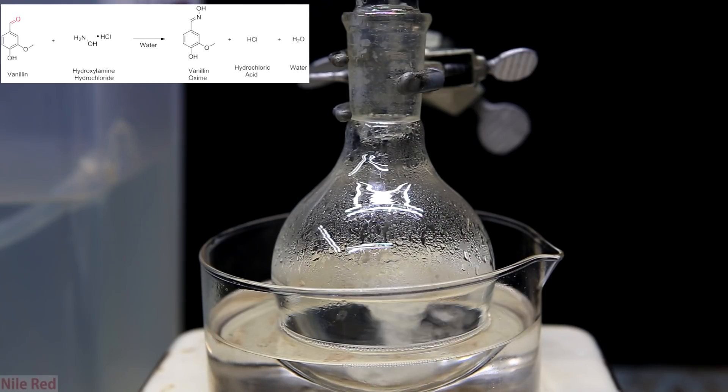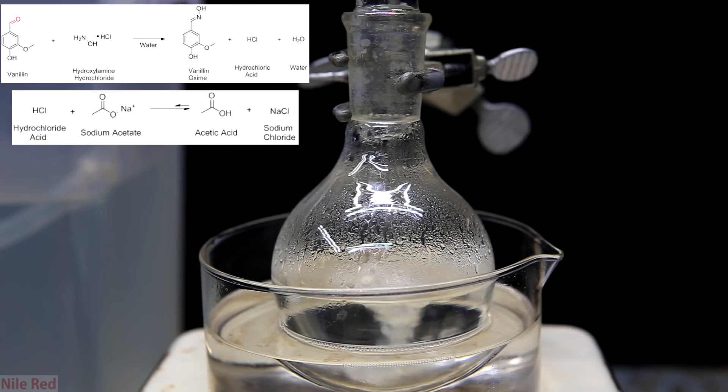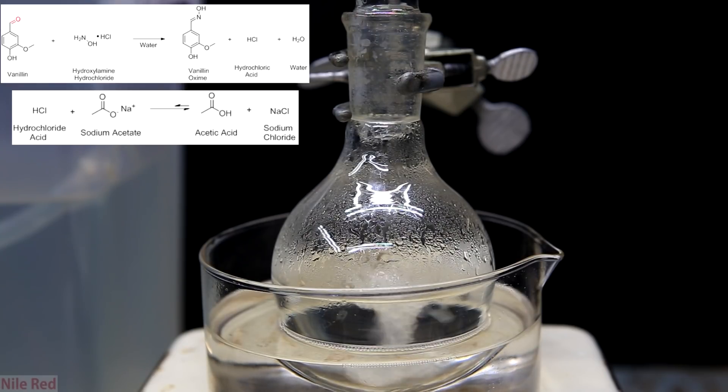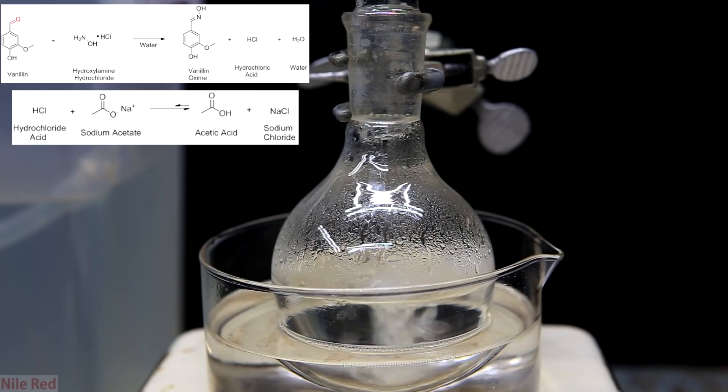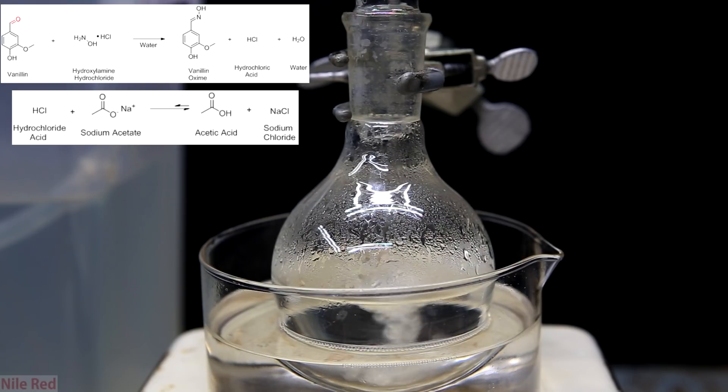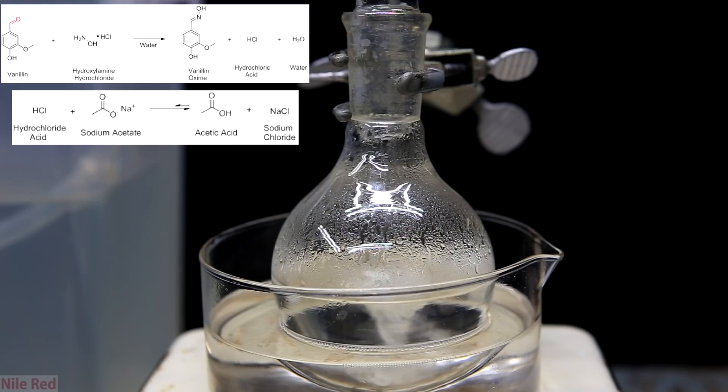Also the reaction mechanism is pretty simple so I'll actually go over it. First of all I'll address what the sodium acetate is doing and it's really not actually participating in the reaction. The sodium acetate is present in order to sequester the hydrochloric acid and form acetic acid instead. The reason for this is that strong mineral acids like hydrochloric acid can react with our oxime and re-react. The addition of the sodium acetate will make an acidic buffer solution.